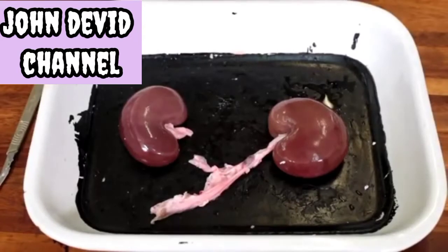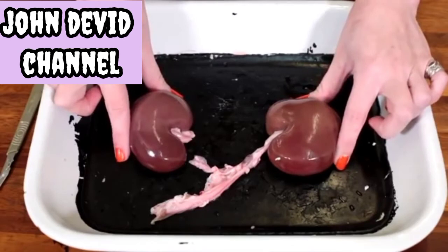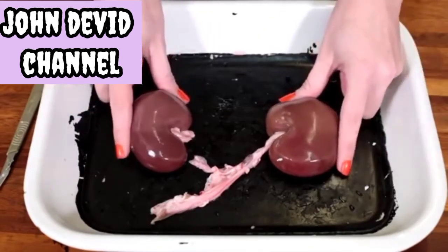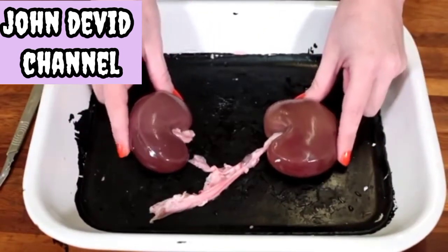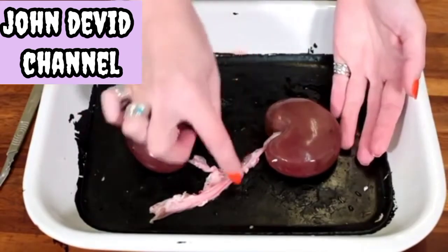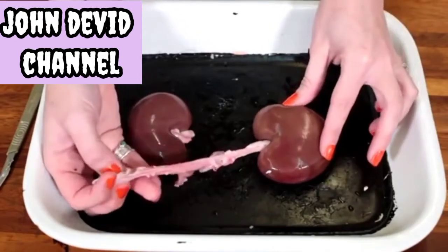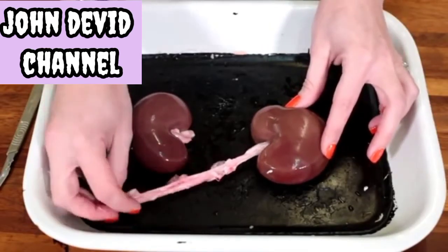Once we've removed the fat we can see the more familiar bean-shaped kidney. I have a pair of kidneys here, so there's one on the left and one on the right of the body. On this kidney we can see the vessels that are attached, and there will be three vessels that you can identify at this stage.